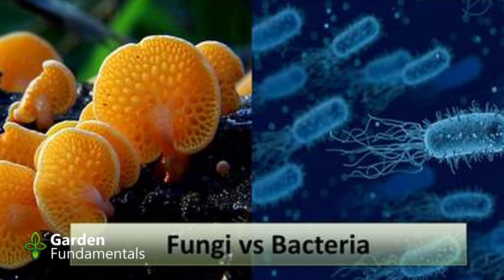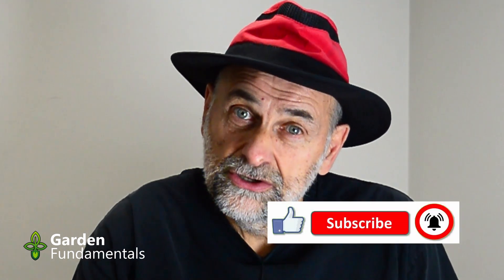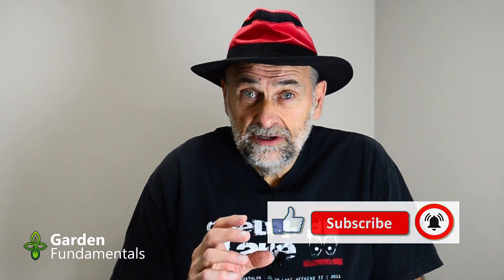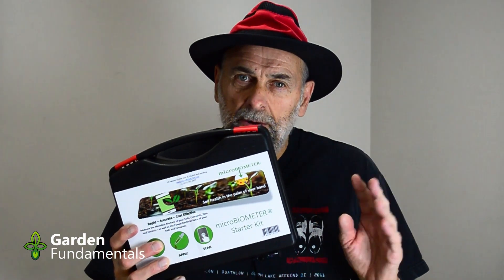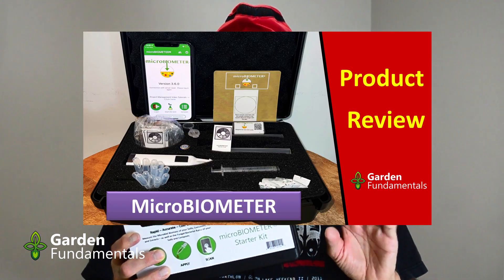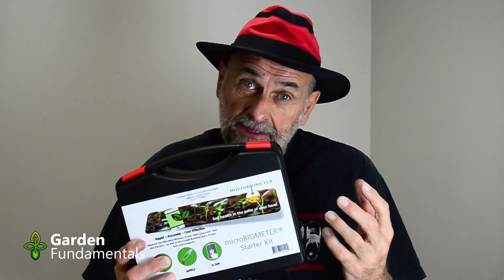It also gives you the fungal to bacterial ratio — that FB ratio. My goal in this video is not to tell you how to make great compost tea. What I want to show you is how to use the test. I'm going to do that by making some compost tea and monitoring the microbial content during the process. The results are really interesting. I'm also going to talk about the accuracy of this method and some other tests I've done with it.